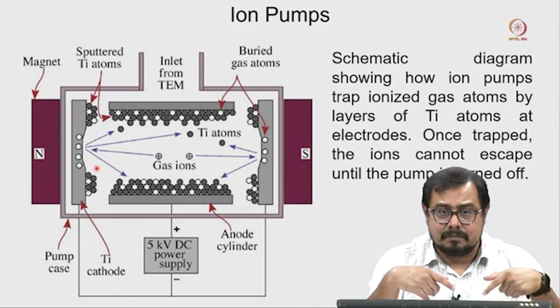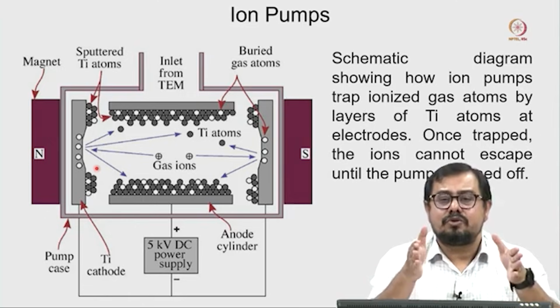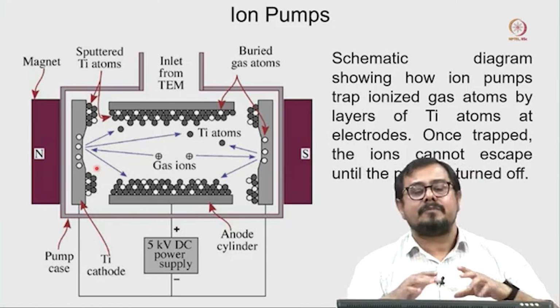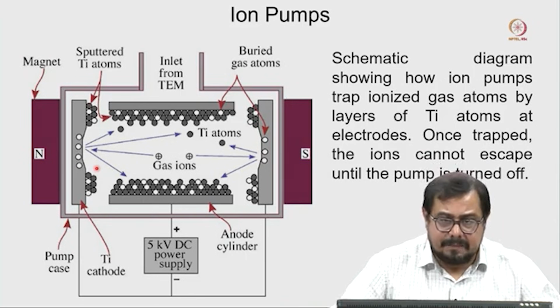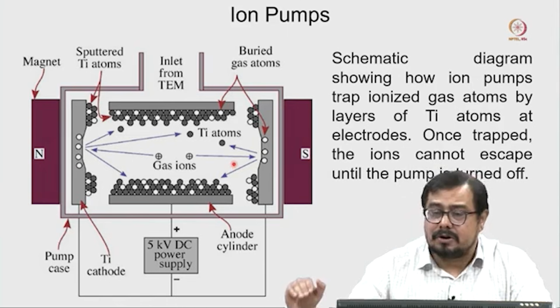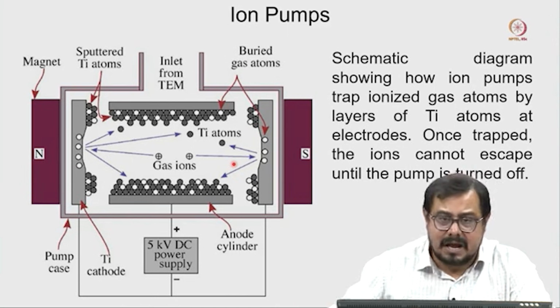pump will start. If in our lab there is a microscope crash and I forcefully start the ion pump from the beginning, it is going to exhaust the ion pump completely, the entire ion pump will be damaged, and that will be very expensive. So, that is one of the reasons we cannot start the ion pump at the beginning; we have to wait a little bit and then we can start it.